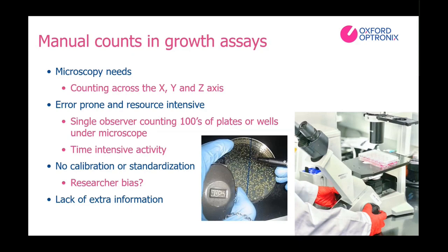It should also be noted that the repetitive and tedious task of counting organoids can cause both physical and mental fatigue, which can seriously affect the accuracy and reproducibility of results, especially across large counts. And studies have actually shown that human error from investigative fatigue is such a serious problem that errors of 100% or more have been observed in lengthy counts.